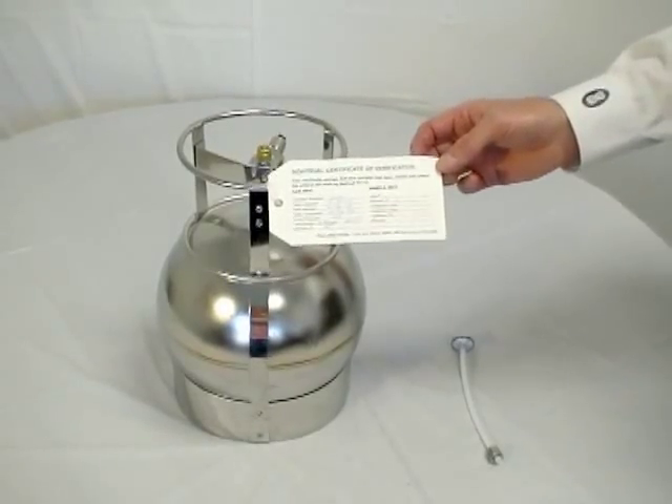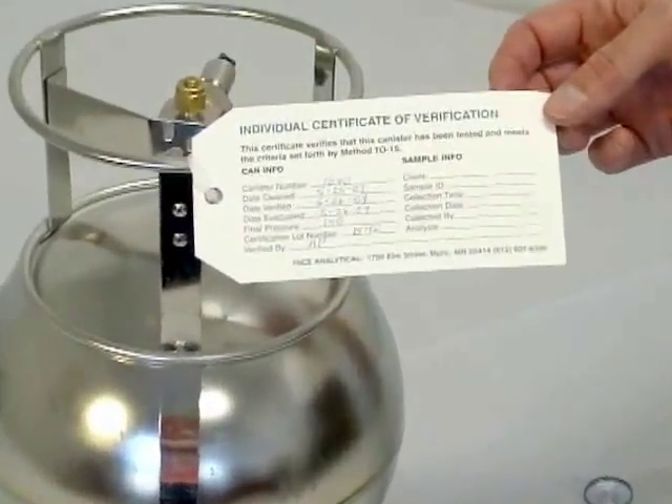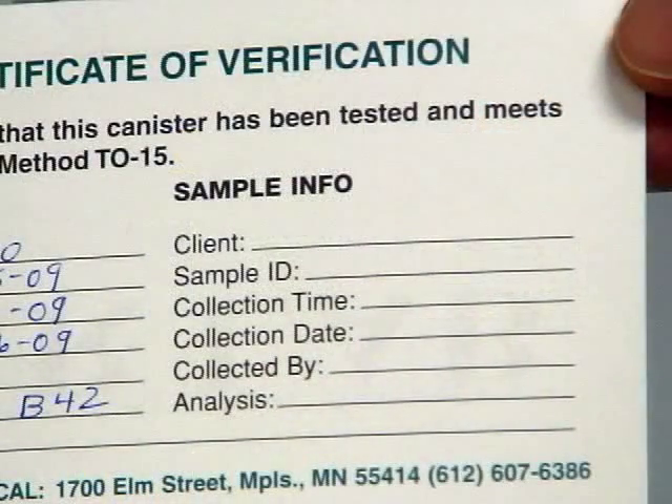See the sample documentation tag attached to the canister. Take a minute to record your sample information on this tag in the allotted area, including the client name, sample ID, collection time and date, name of sample collector, and the analysis. It is very important that you document this for your field quality control, and it will help you in the next step.